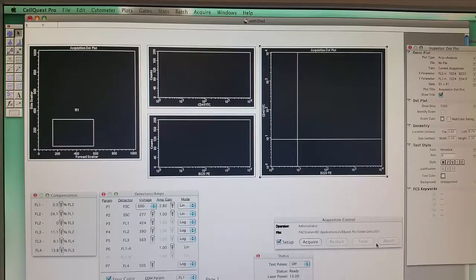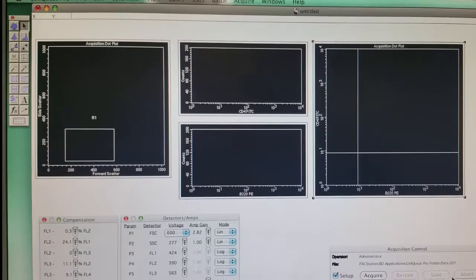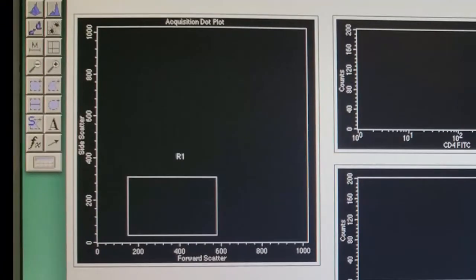Here we're looking at the computer program that accompanies the flow cytometer. There are several different black windows — that's where the data is going to be displayed — and a bunch of different gray windows that surround them, which are all the controls for the machine. This first window allows us to look at forward scatter on the x-axis and side scatter on the y-axis, which allows us to visualize the size of the cells versus the complexity of the cells.